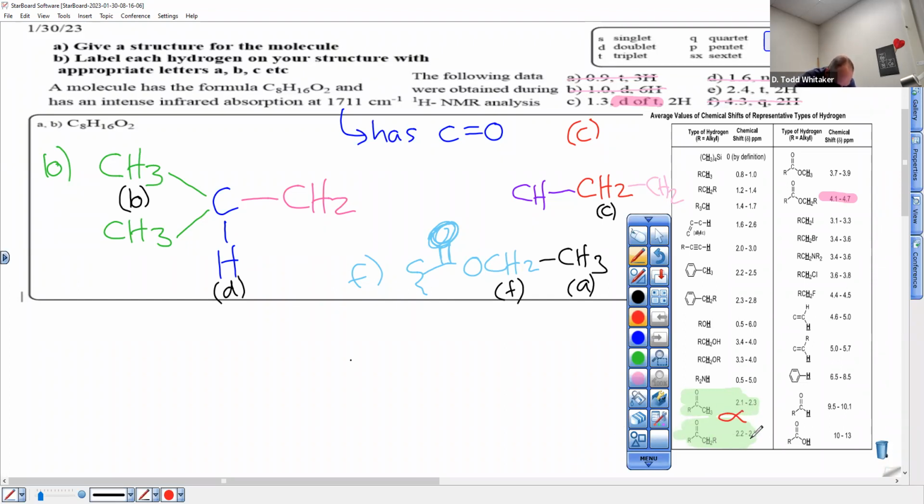And 2.4. So this carbonyl, we know something about Mr. Squiggle now. And here's Mr. Squiggle coming up. Here's carbonyl redrawn. Here's the other side of the carbonyl. If it's 2.4, it fits there. If it's attached to a CH2, it fits. It's a triplet, right? Is this going to be E? And that's our pink triplet.